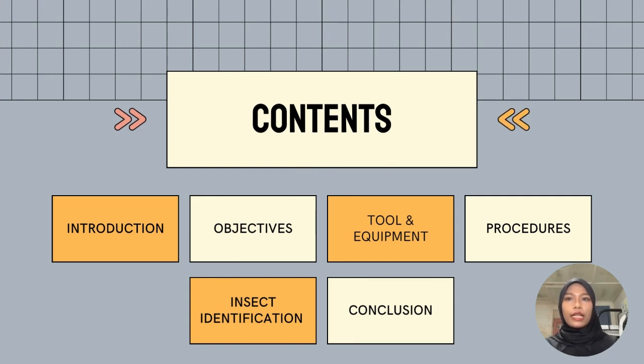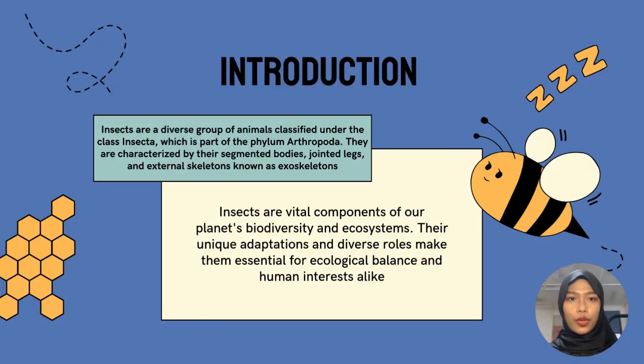This is the content that I am going to share with you guys. Firstly, the introduction. Secondly, the tools and equipment that I use to collect the insect. Thirdly, the procedures. Fourthly, the insect identification. And lastly, the conclusions. Now is the introduction.